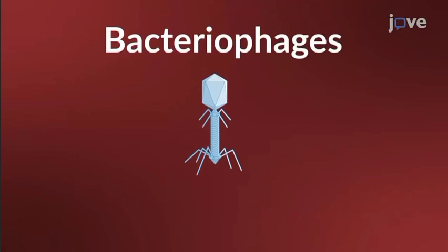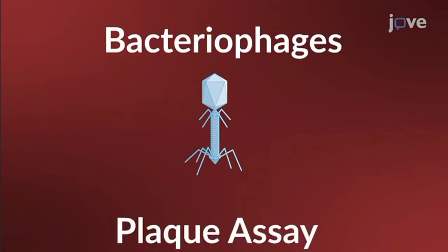Bacteriophages, also called phages, are viruses that specifically infect bacteria, and we can confirm their presence and quantify them using a tool called the plaque assay.